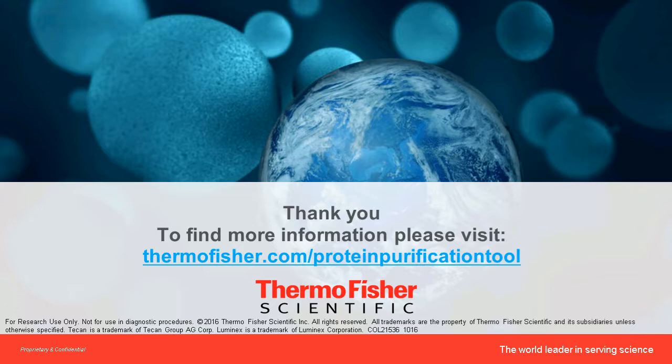Also, I would indicate that with the broader accessibility of high-resolution mass spectrometers, you will see more and more biologists adopt this particular technique because they have a broader set of questions they ask from these samples, particularly when it comes to post-translational modifications.